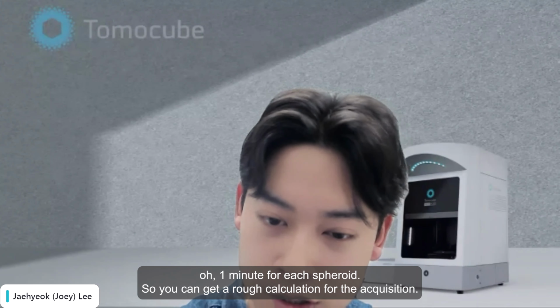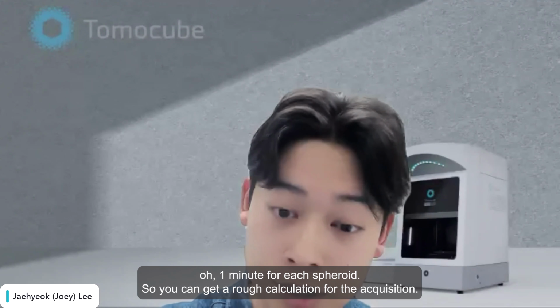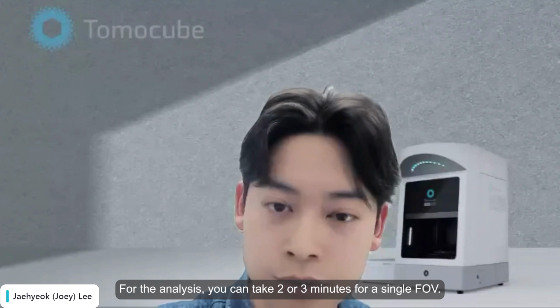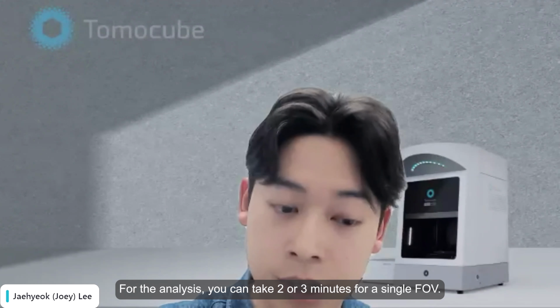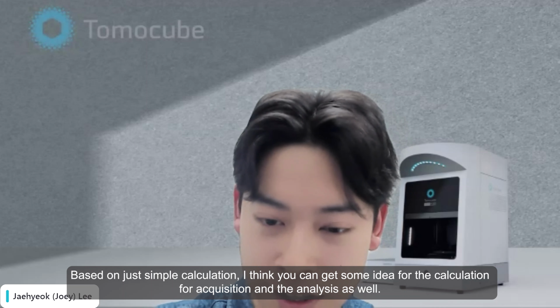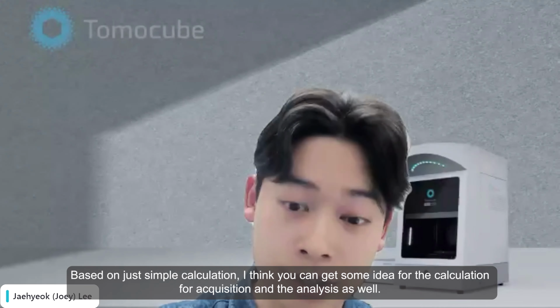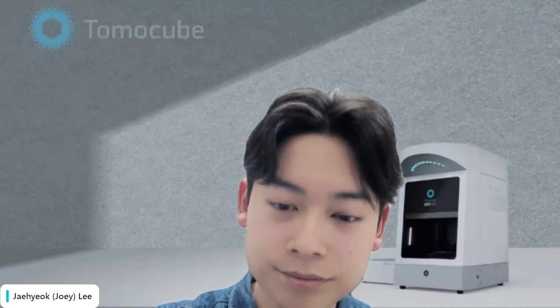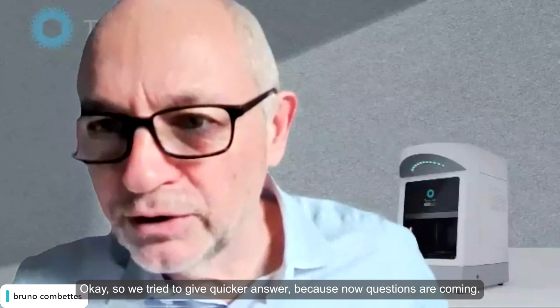So you can get some rough calculation for the acquisition. And for the analysis, I think you can take 2 or 3 minutes for a single FOV. So based on just simple calculation, you can get some idea for the rough calculation for acquisition and the analysis as well.